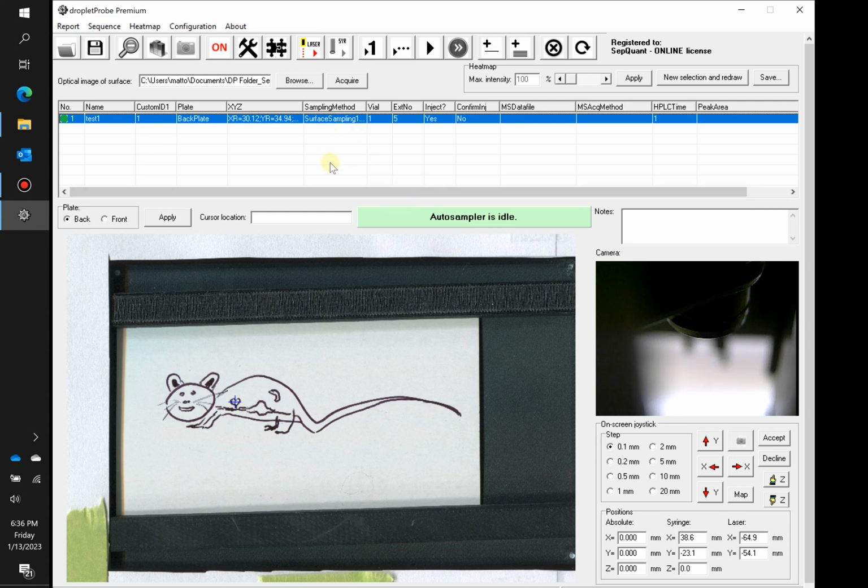So now that I have this done, I want to do a quick check. In our daily workflow, for the first sample of the day, we do a laser measure distance and an actual go to syringe position so that you can get a little bit of an idea of where you're going.